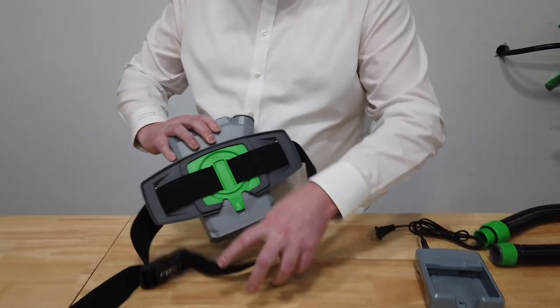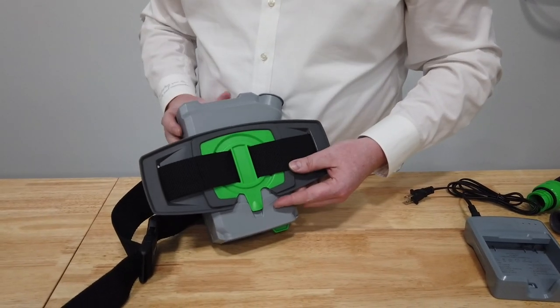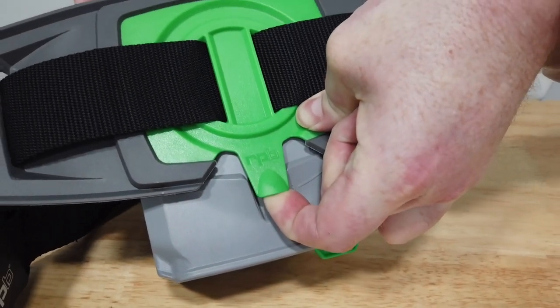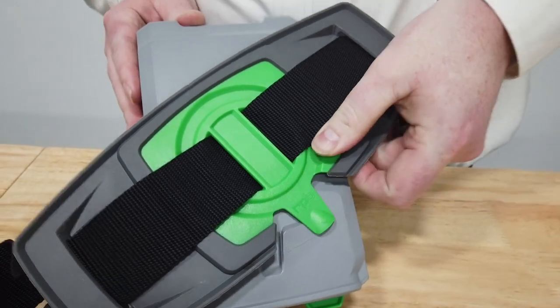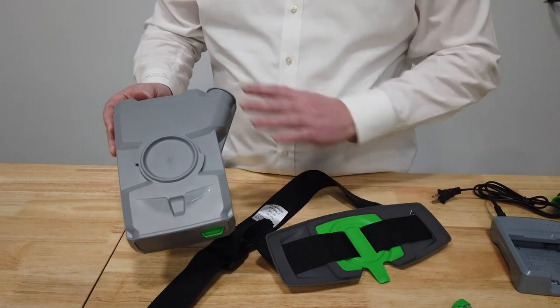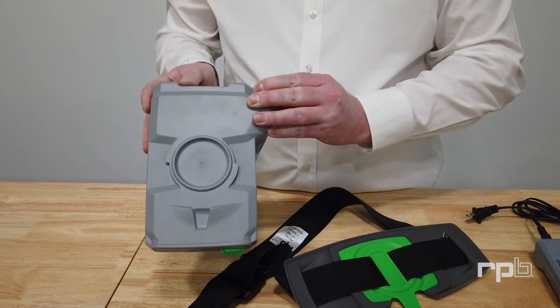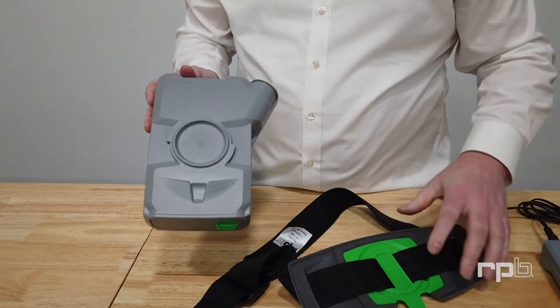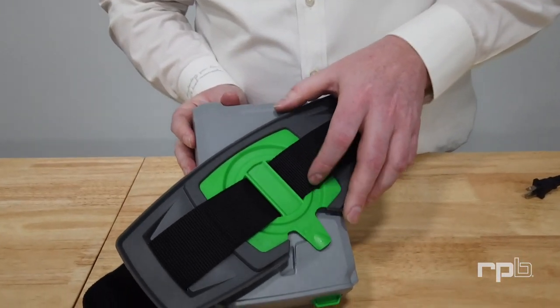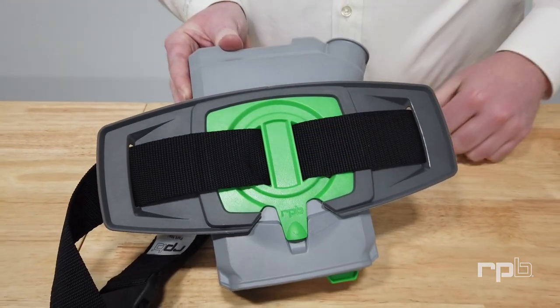With the PX5, you can also remove the belt to help with cleaning the unit. Get the latch and lift up on it, then rotate that belt holder and remove it from the PX5. That makes it easier for cleaning, decontaminating, and storing the unit. To reattach it, locate the belt onto the back of the PX5 and twist it back into position.